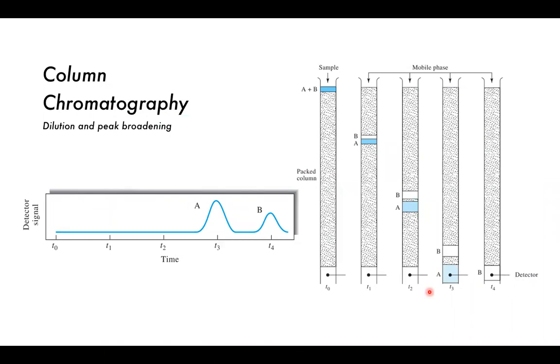So in the case of column chromatography, we have a packed column here, which is usually filled with something like silica or alumina. Now the silica or alumina can be modified to provide differences in the retention times. So we obviously have our sample, which is placed very carefully on the top of the silica packed column, not to disturb that surface and keep it very, very flat. Sometimes sand is actually placed on top of there to try and protect the column, a very, very small amount of sand. Then we put our sample there.